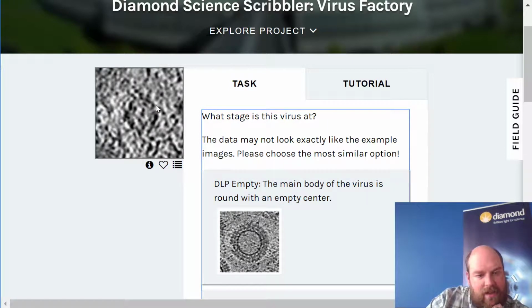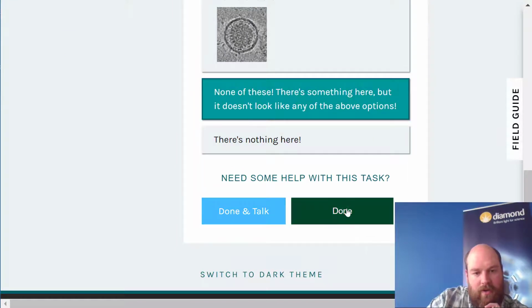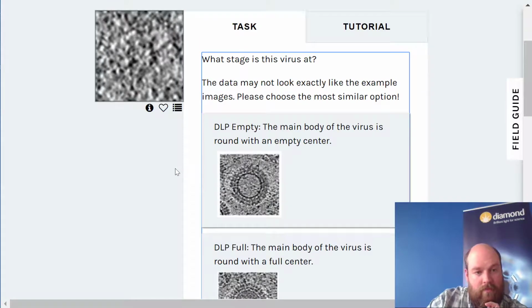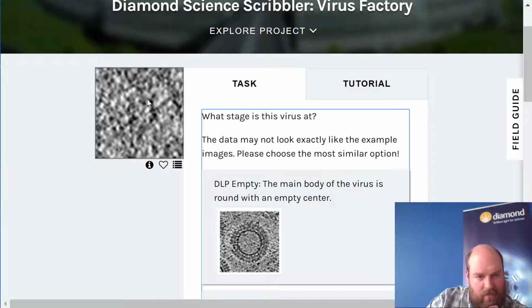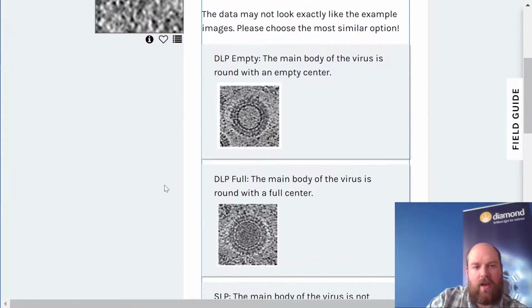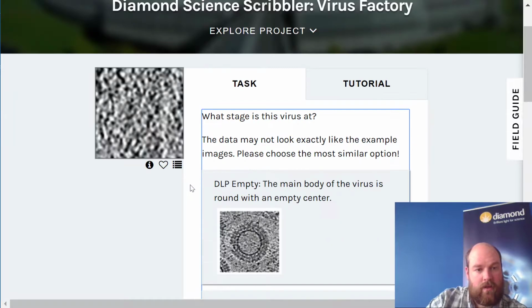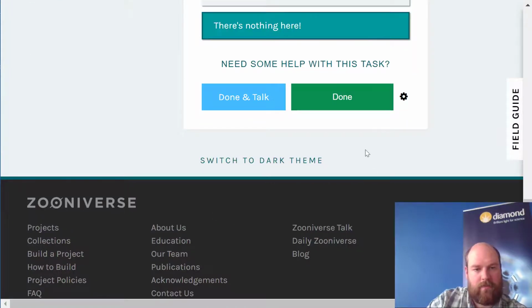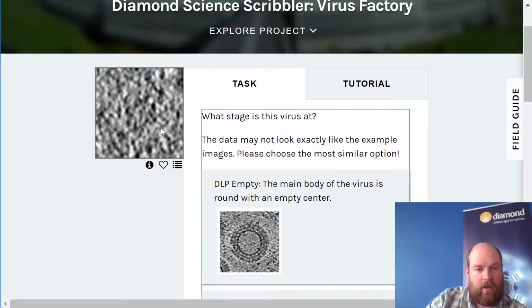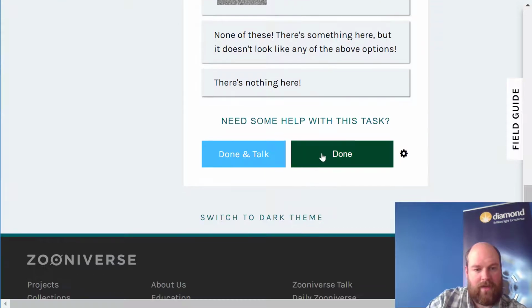In fact, actually, you know what? I'm going to change my mind. I think that's not a virus. Yeah, I can't see anything in that one, so I'm going to say there's nothing here. And I'm going to say there's nothing here too. I was just hoping to find one. Oh, I can just see the edge of a star shape there, so that's probably one of these.